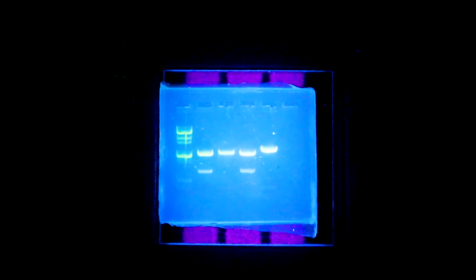Once you've done that, you're going to sketch out your gel, you're going to answer the couple of analysis questions, and then we will come together as a class and talk about the conclusions and maybe what are some other things we could use DNA profiling for besides just solving a potential crime.